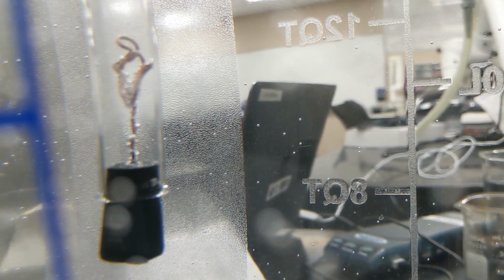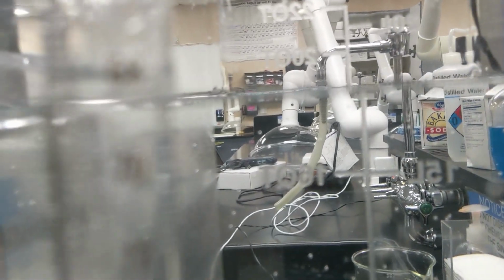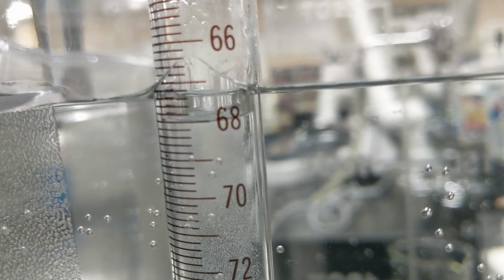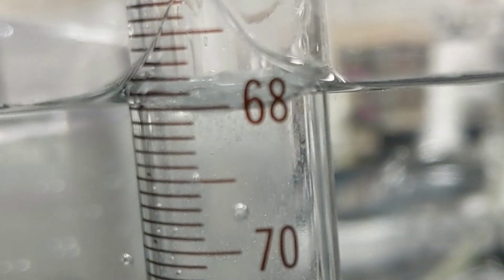Okay, so now we're going to equilibrate the pressure and measure the volume. Let's adjust this so the water level's about the same. Okay, so you can get the reading. That looks pretty clear, right? Yeah. So I'm just putting it slightly off the edge so we can see where the barometric is.